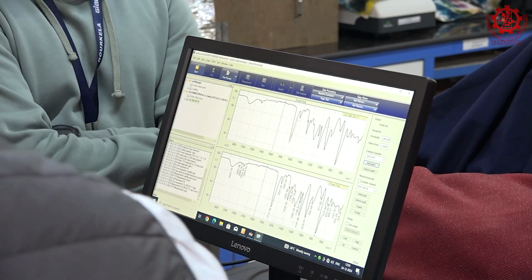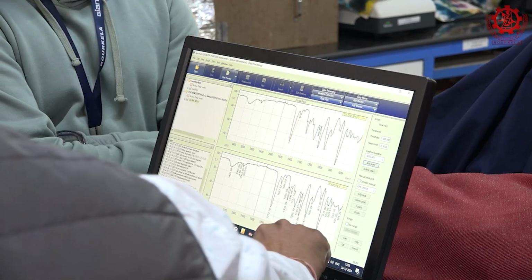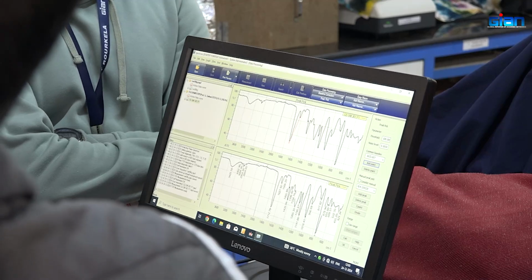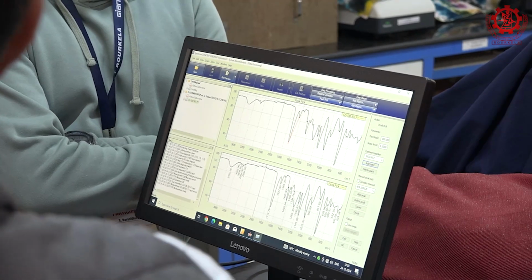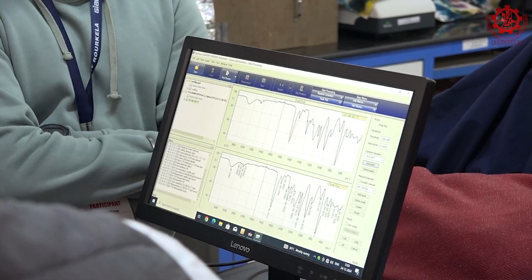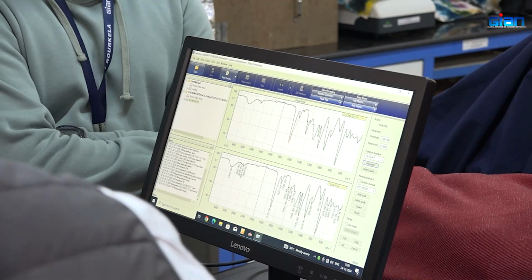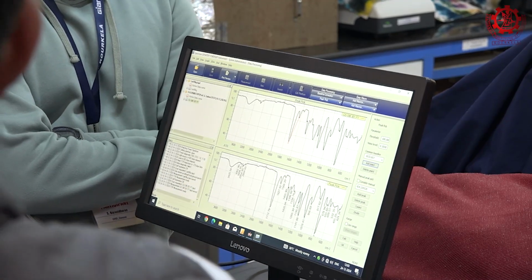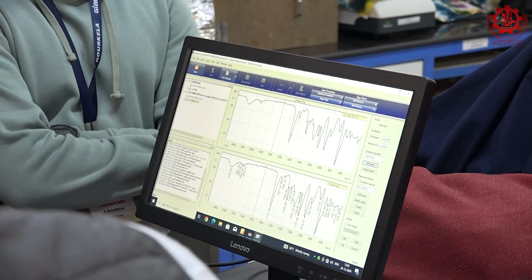Okay. That's why most people study from 1400 to 4000, where the peaks are fewer, and that is the functional region. For example, you must know ketone, aldehyde, ester. What is the functional group there? The carbonyl. Okay. And the carbonyl, for example, here it comes at 1712. And many times we are involved in the identification of functional groups.